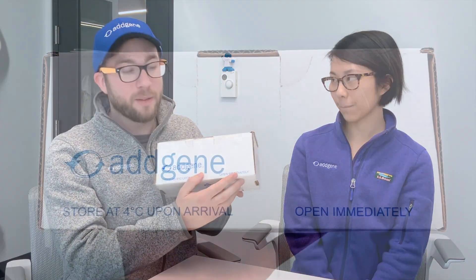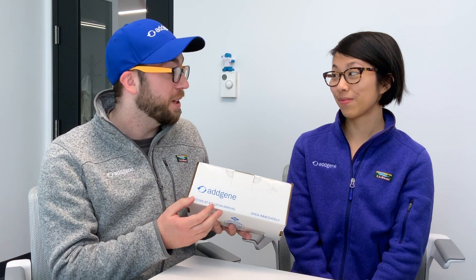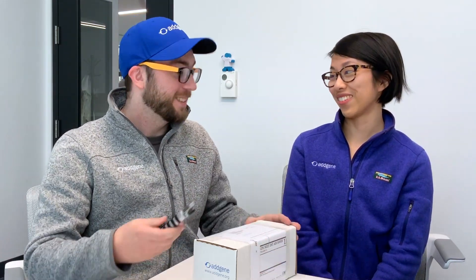The first thing you want to do is open immediately and store your plasmid at four degrees. If you don't do that, all the cells will continue growing, all your samples will die, and you'll have wasted all your money. That sounds pretty terrible.